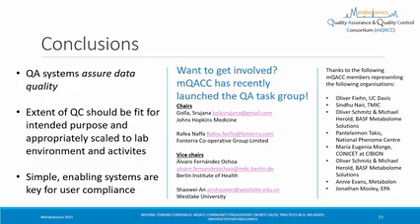Thanks to all the people who very kindly sent me some material to discuss today. The reason this talk doesn't look like the others is because we're just getting started with QA in mQACC, okay? So if you're interested, there's a new task group here. Don't confuse QA with QC like I've clearly done here on this slide. It's very easy to do, but bottom line, QA assures data quality. It doesn't create it, it doesn't make it, it just helps assure it for efficiency and make sure that things are fit for their intended purpose, right? So that's it from me.